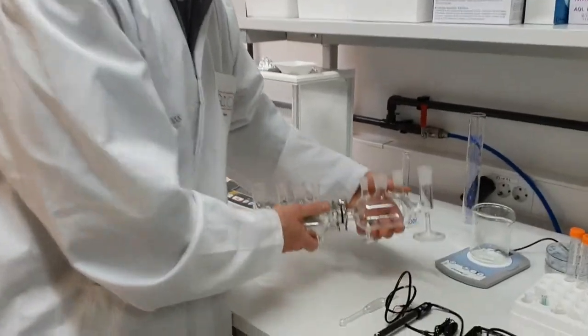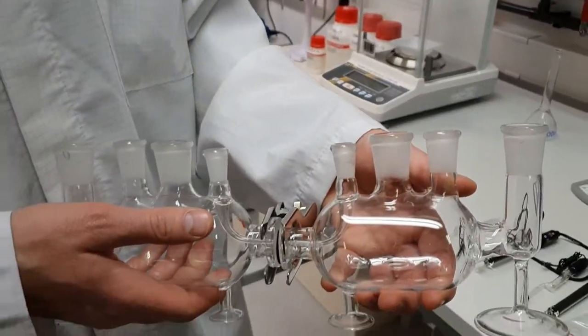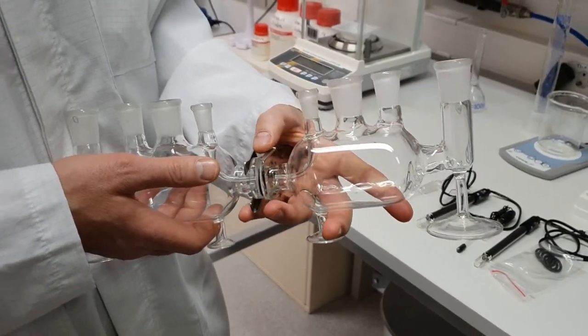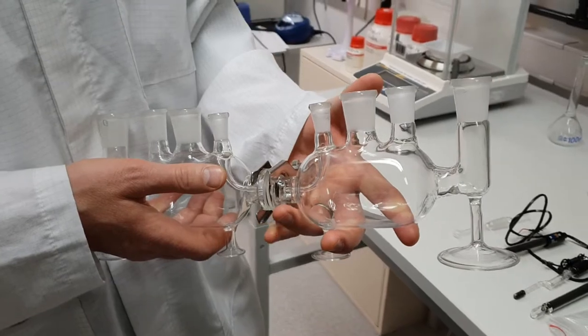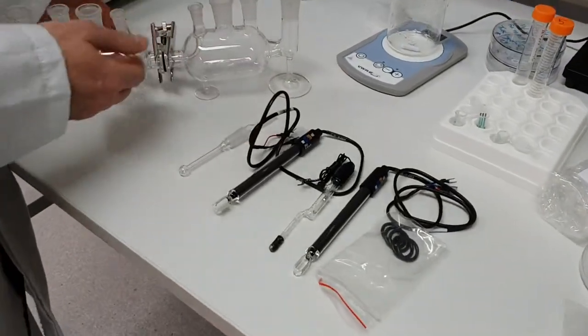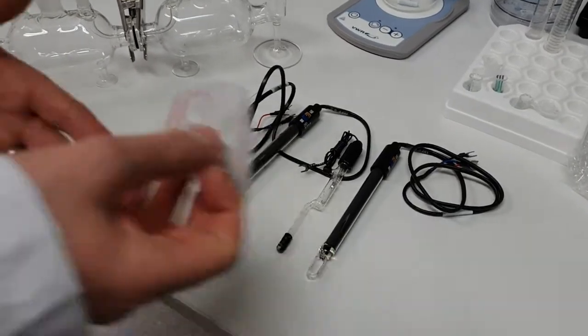So this is effectively two half cells that are clamped together. You're meant to put your membrane on between the clamps. Now with the Divanathan cell, you have the two half cells, you have the clamp, and you have a pack of O-rings.